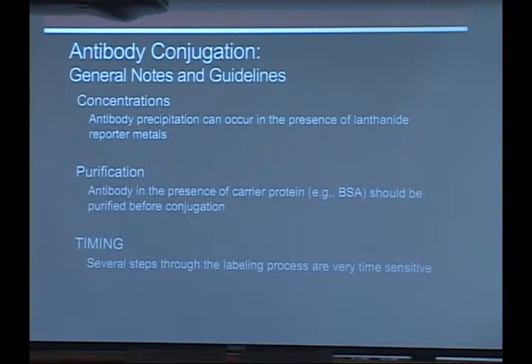Since we're reducing antibodies, we're destabilizing them, essentially. We're breaking bonds that are important for their structural integrity. And so we want to make sure that we're not subjecting our antibodies to these kind of harsh conditions for too long of a period of time. So the timing of the protocol is also pretty important. It's not one of those things in the lab that you want to leave sitting around while you go grab lunch and come back in a couple hours.